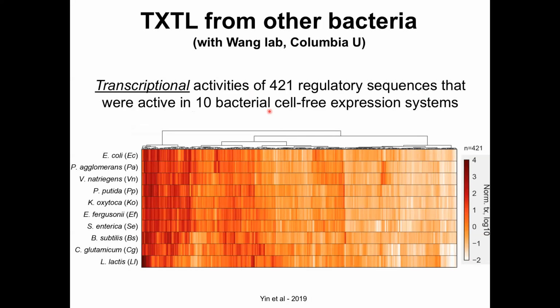Here it is. Let me show you just this example. You can go up to 1,000 promoters in just one tube. Those hundreds or up to 1,000 different regulatory elements, and here they are promoters. And you use next generation sequencing to look at the frequency and the strengths of these promoters, and you can align everything by sequence analogies here, from very, very strong up to weak promoters.